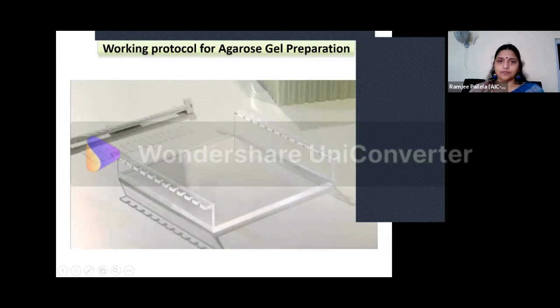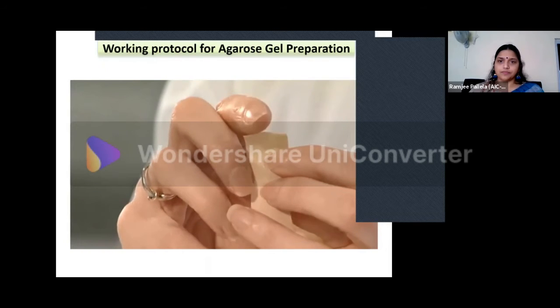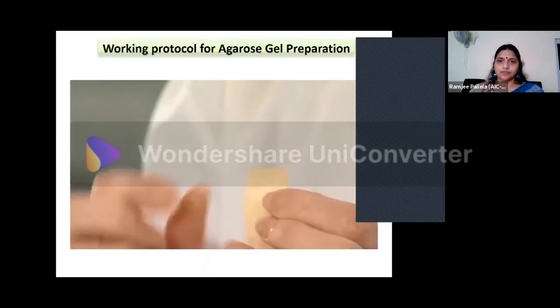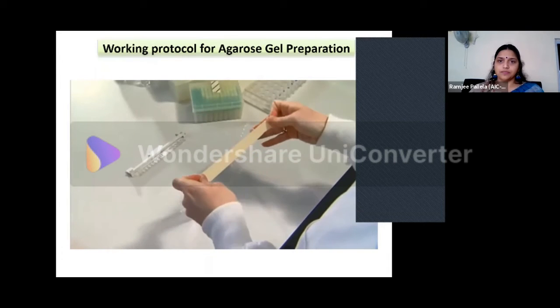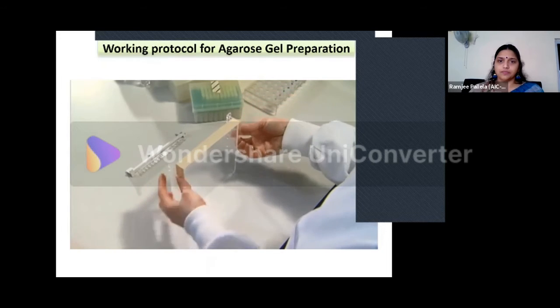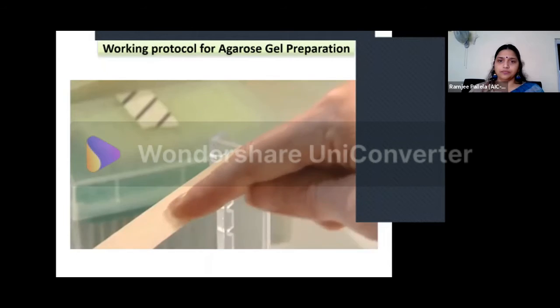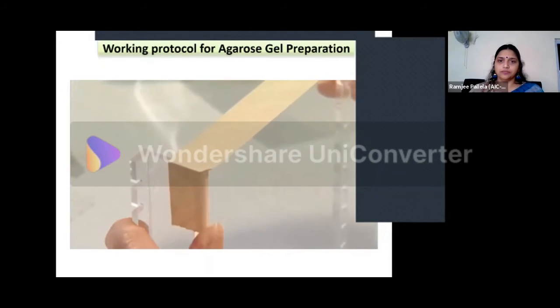Gel trays have two open ends that need to be sealed while the gel is solidifying. This is easily achieved using masking tape. Take a piece of masking tape that's a few centimeters longer than the open end of the gel tray and fold over one end of the tape to make it easier to remove later. Place the tape around the end of the gel tray, overlapping both sides of the tray, and make sure it's firmly stuck along the entire end.